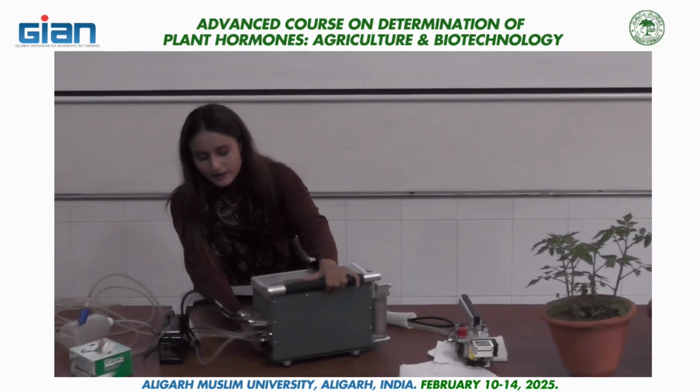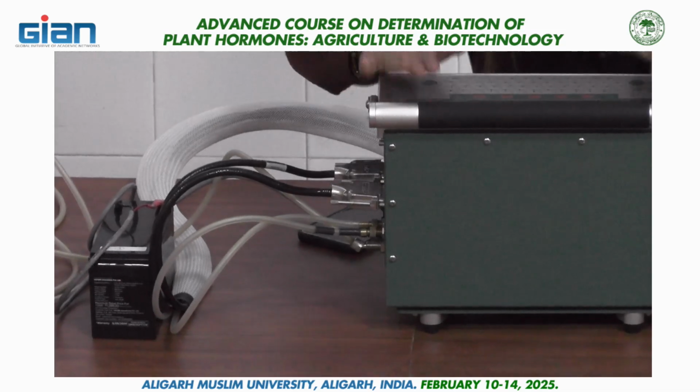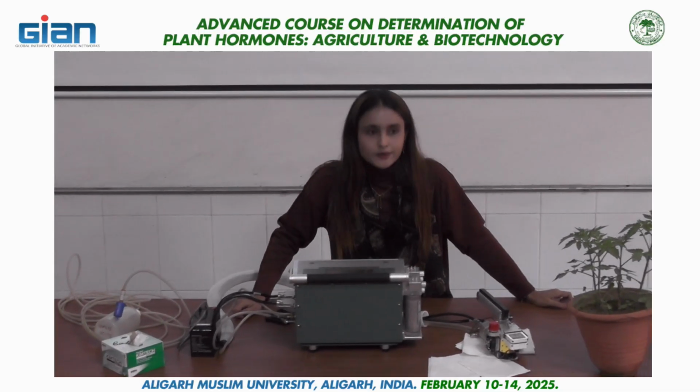So here we have this switch. We'll switch it on. It will take some time to warm up or to stabilize. So we have to wait for 30 to 40 seconds.